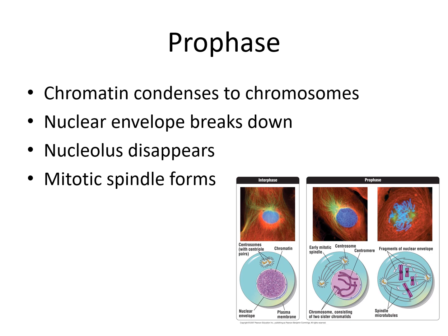Here is an image of interphase, and then prophase. In interphase, what you see is a nice defined nuclear envelope and uncondensed DNA in the nucleus, so you have a nice even color in the nucleus. When prophase begins, this is early prophase here. This is early prophase here. This is late prophase here. What you see is a progression of these 4 different things occurring.